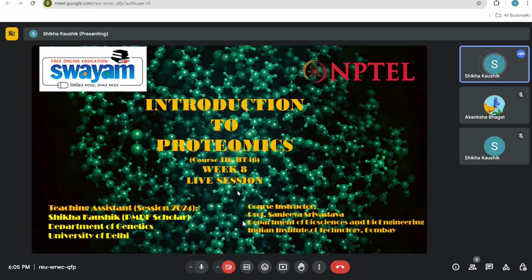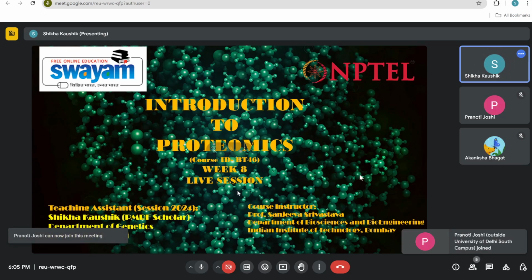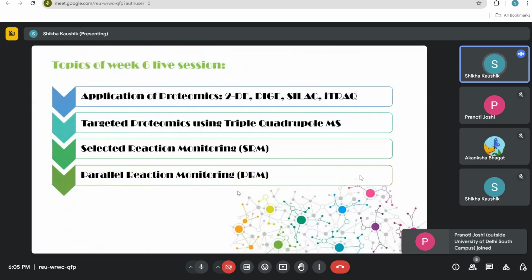So today we will be ending our session where we will be talking about application of proteomics. Today's class is going to be mostly application of proteomics, and then I'll talk about targeted proteomics using triple quadrupole MS, and we'll discuss in more detail selected reaction monitoring and parallel reaction monitoring.